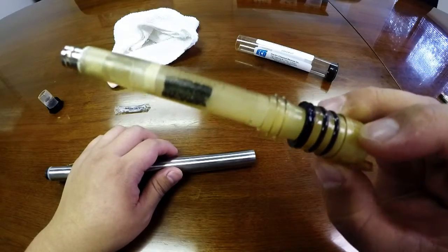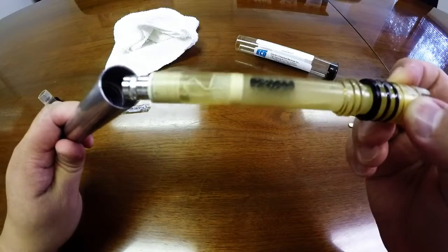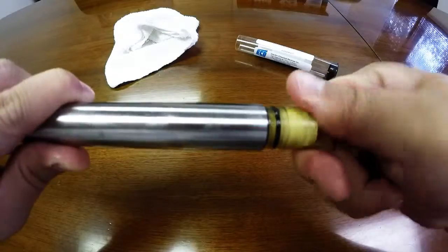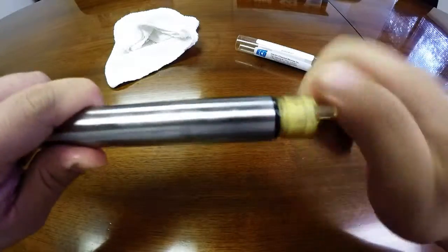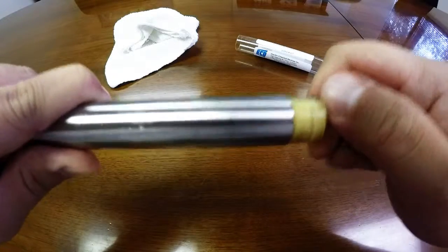Now that the lubrication is on the O-rings, you are ready to install the electrode to the S80 body. Press in and turn clockwise until it stops.